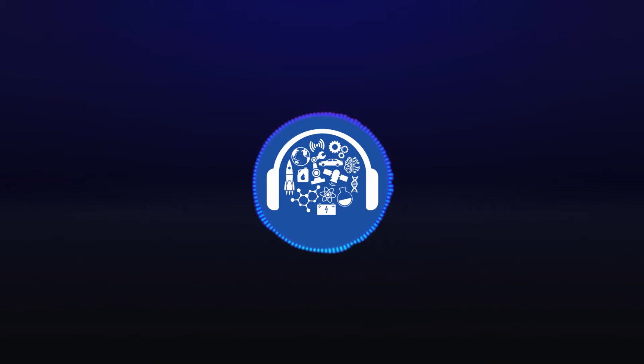An unfortunate reality to this kind of instrumentation is that there's noise. There are signals picked up by the instrument software that in reality aren't helpful or useful. They're just kind of noise in the background.